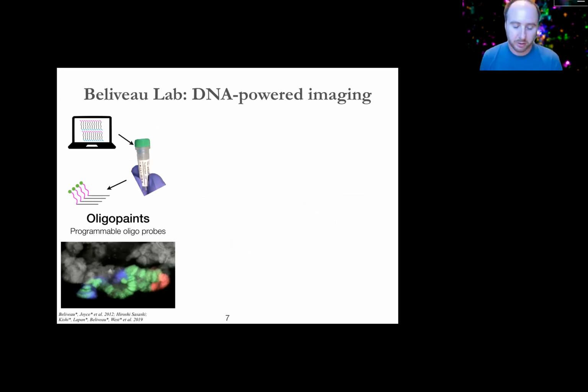But to transition into what I'll talk about for the rest of the time, our lab, and as a trainee in some of the labs that I was mentioning in the introduction, we've focused on trying to develop new tools that are easy to use and accessible to help ask questions, primarily in this space, but I think there's also nice applications, especially for things like spatial transcriptomics with the SABER technique I'll talk about in a little bit.